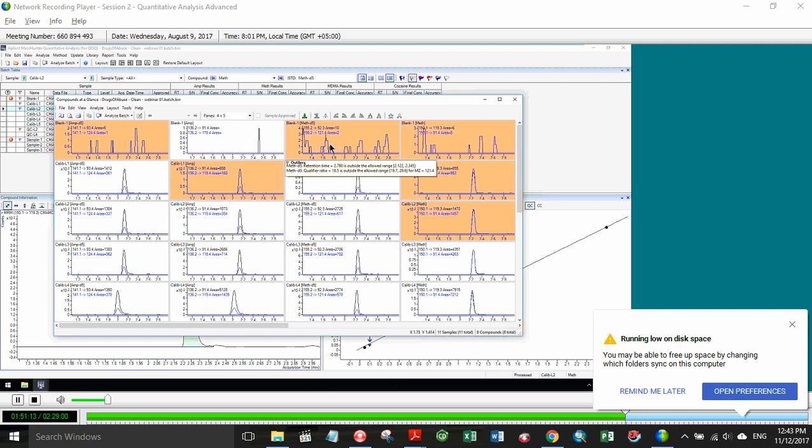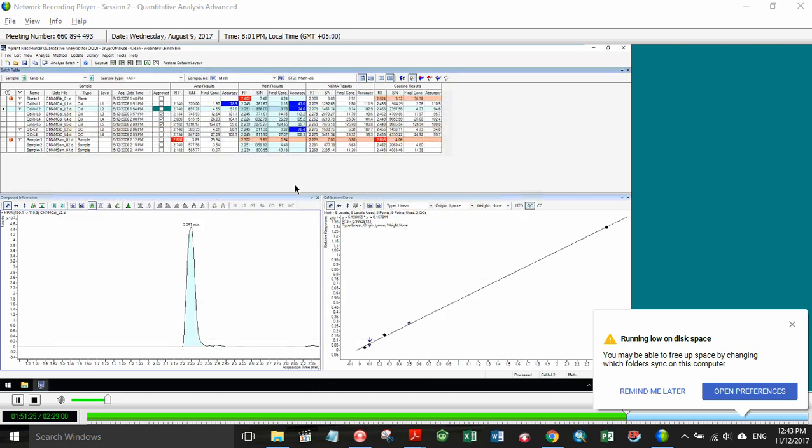Is there a similar or equivalent feature in MassHunter other than appending a directory where the batch is created? Typically in MassHunter, we would append or add the batch there, or you could add samples to the batch table. I'm not too familiar with the quantitation database from ChemStation.